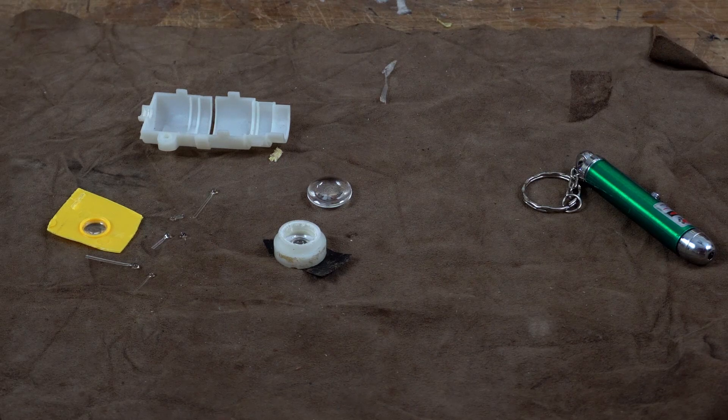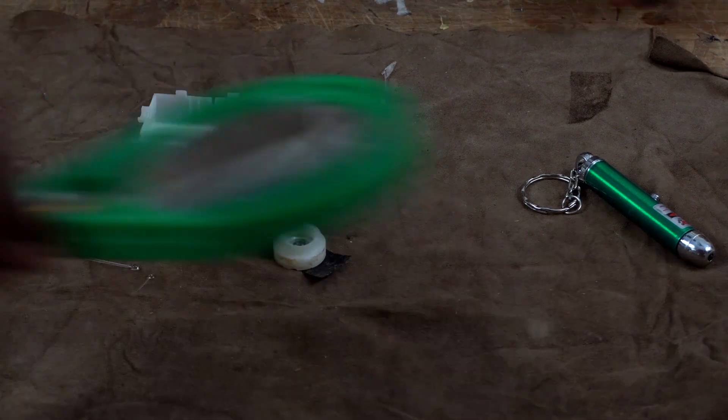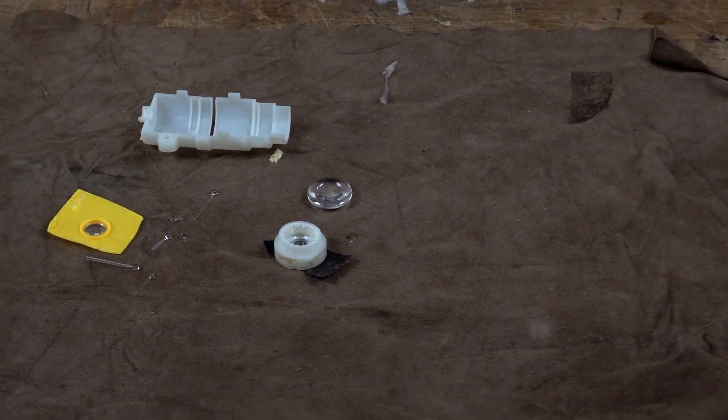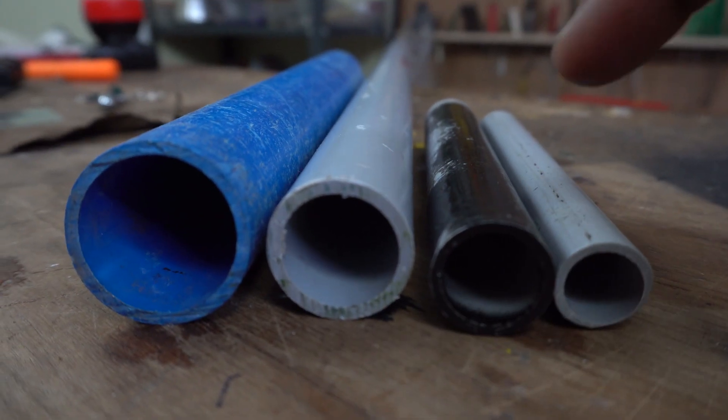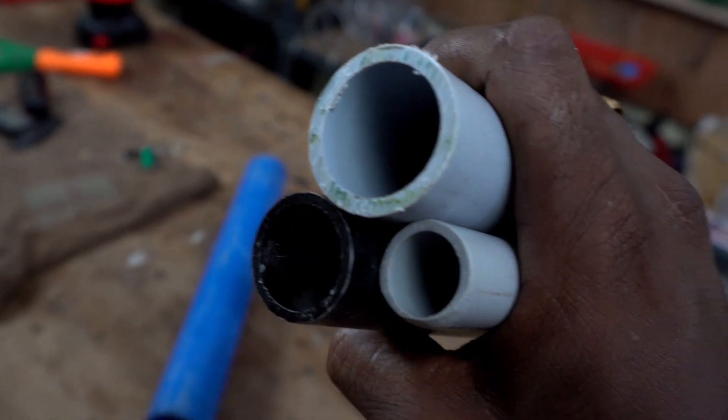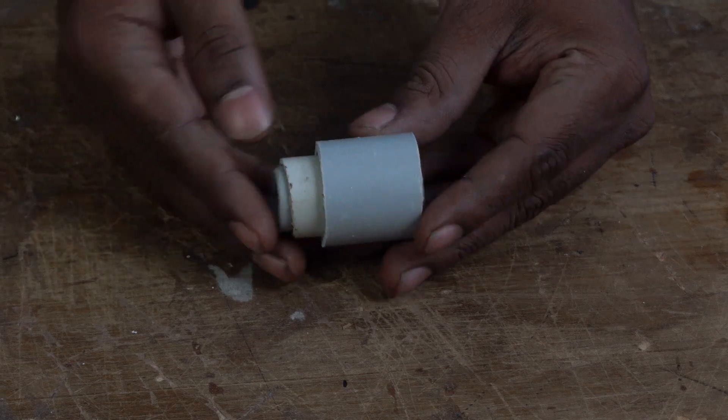Here is the set of lenses I am going to use: glass beads that I made myself, a laser pointer lens, and two bi-convex lenses that I salvaged from a toy projector. To align these, here come the PVC pipes — half inch, three quarter inch, and one inch plumbing pipes. They fit on each other snugly.